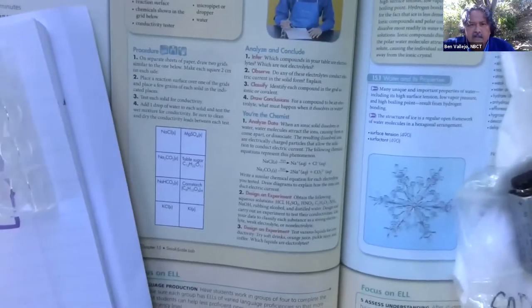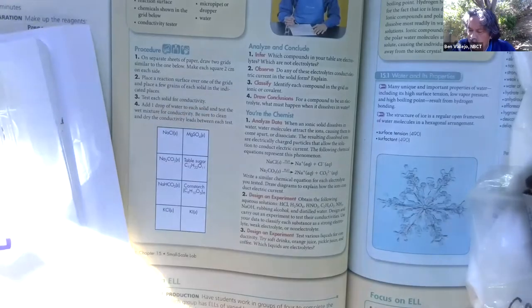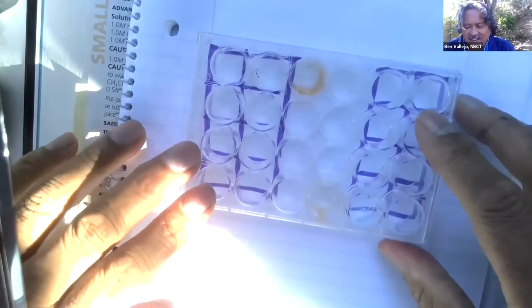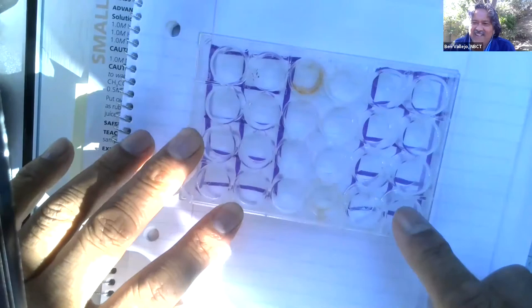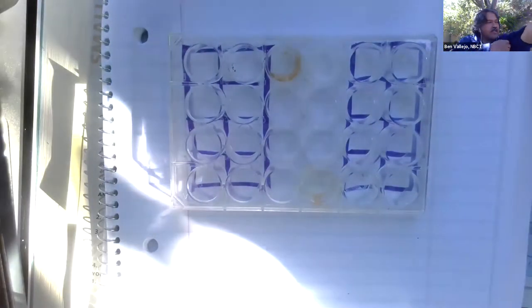Okay, going over here. You place a reaction surface over one of the grids and place a few grains of each solid in the indicated places. Test each solid for conductivity. All right, which is interesting, look, the way I drew it is pretty cool because I got 4x2. This is 4x2. And over here, 4x2. I just got lucky. I would say I planned it that way, but I didn't. Okay, so there it is.